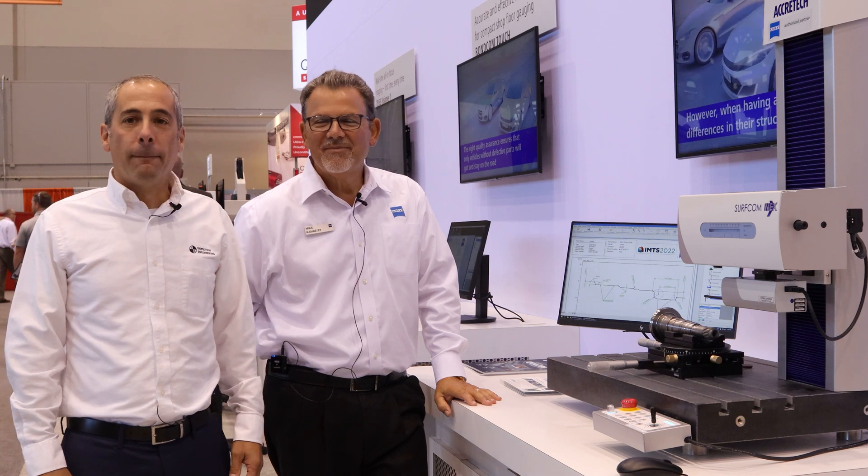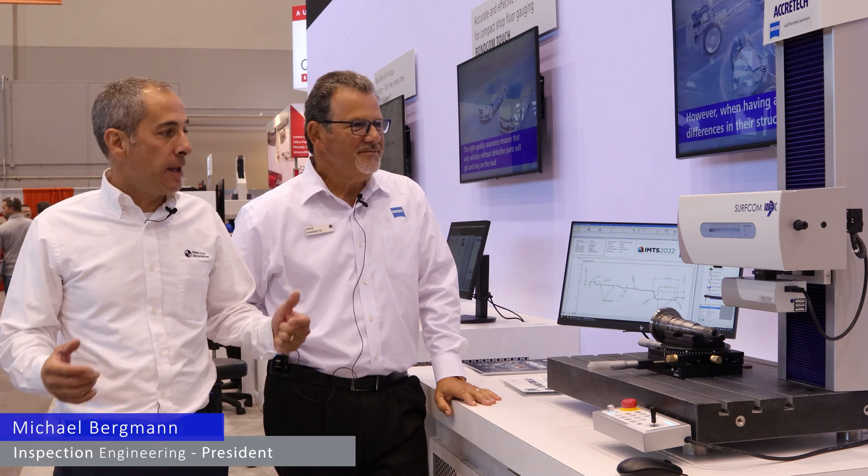This is Mike and Mike. Mike Kambitz from Zeiss, Product Manager for Surface and Form. Michael Bergman, Inspection Engineering — and we are going to talk about what's new from Zeiss and Acrotech in the way of Surfcoms.